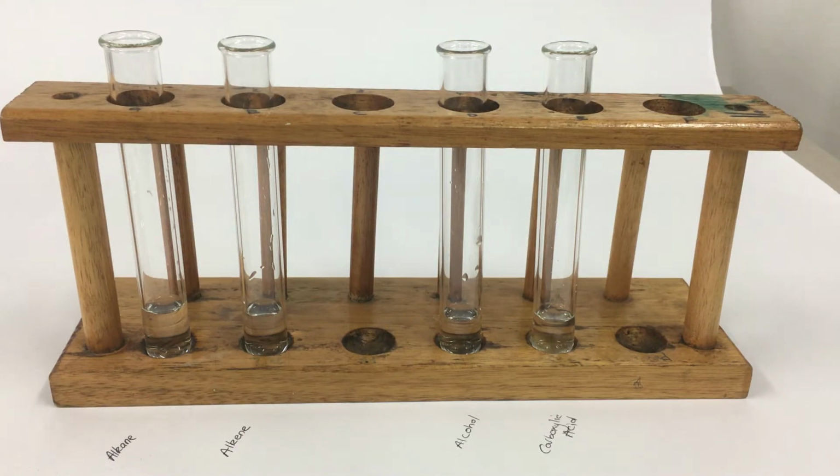Okay, how are we doing, everyone? Looking at solubility of a few compounds today. So in the bottom of these test tubes we've just got water at the moment. I'm going to see what sort of solubility we can look at here.